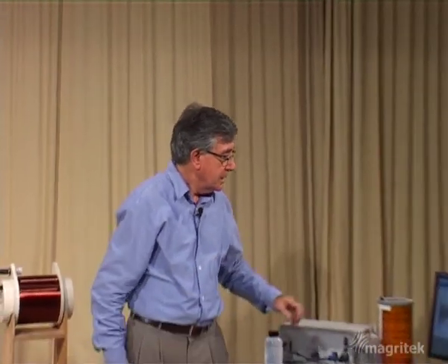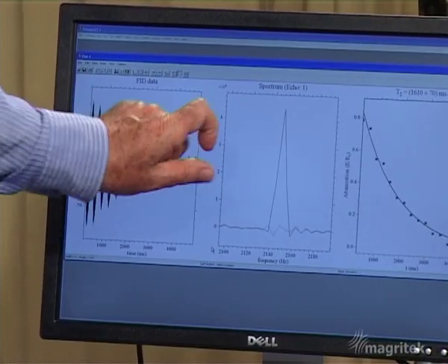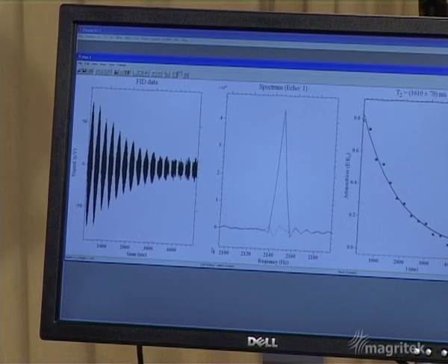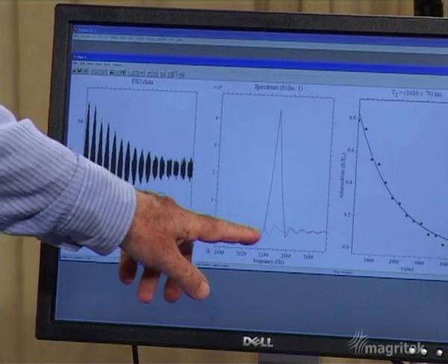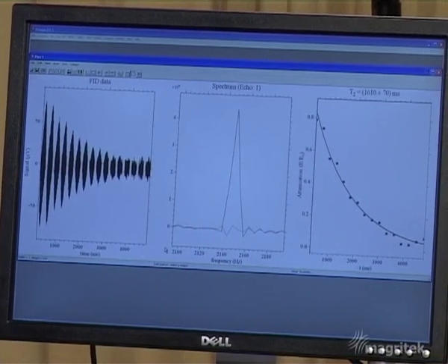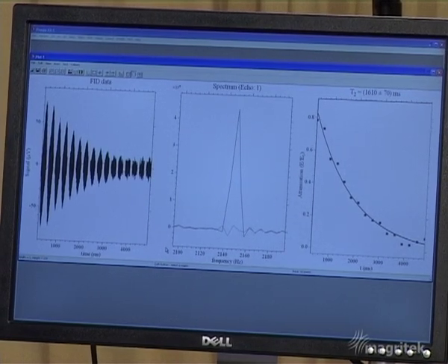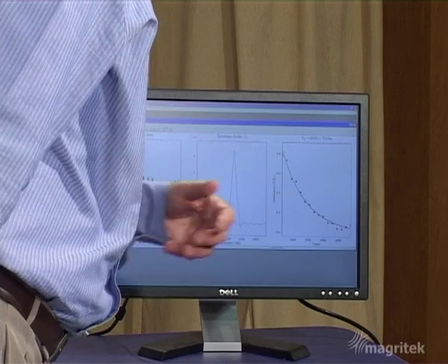Again, I performed this experiment in advance using the water sample. Here we see the train of echoes dying away with time due to this irreversible T2 relaxation. In each case, the echo is Fourier transformed to get a spectrum, and the area under that spectrum tells us about the size of each individual echo.